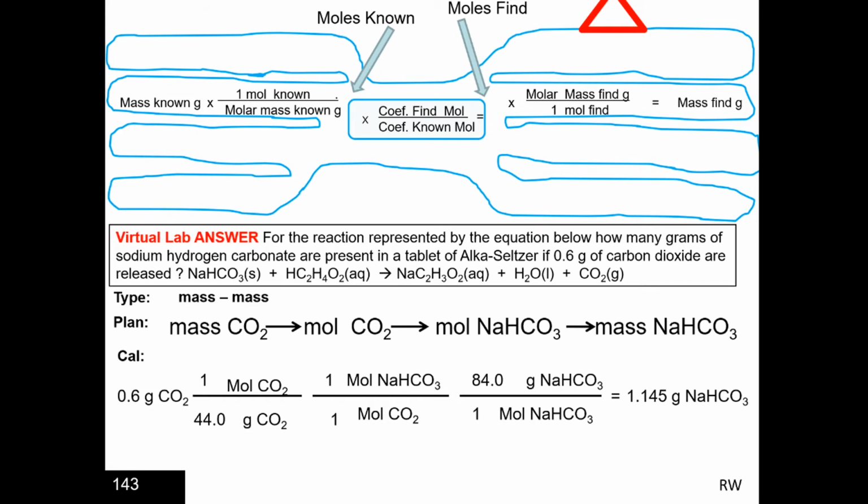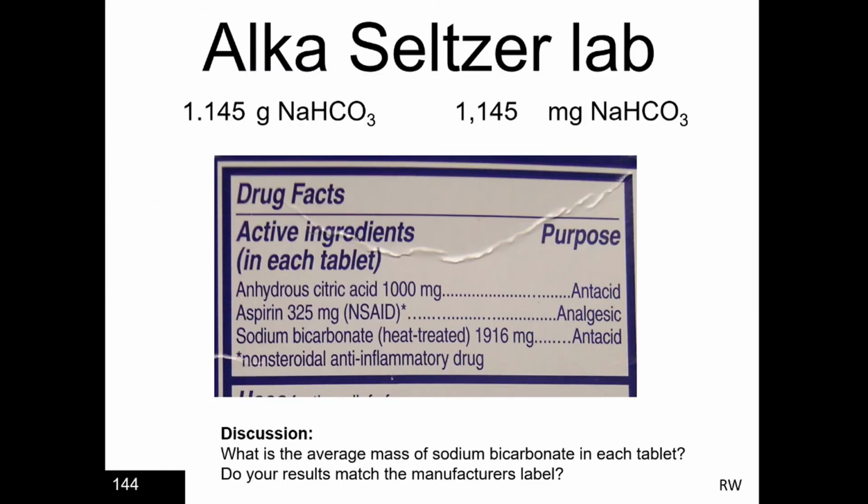All right, the answer is 1.145 grams. Not exactly what they said it was going to be, is it? Okay. Or in milligrams, since the box is in milligrams, we need to make that conversion to milligrams, 1,145 milligrams. And they said it was 1,916 milligrams.